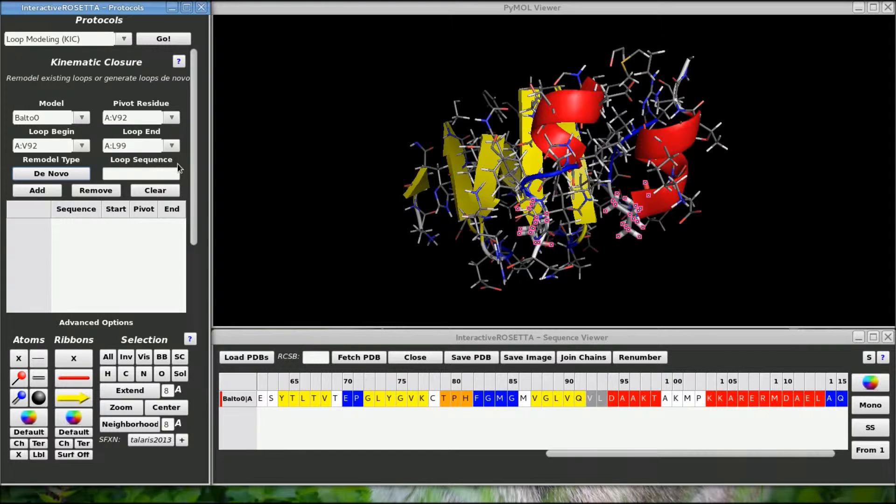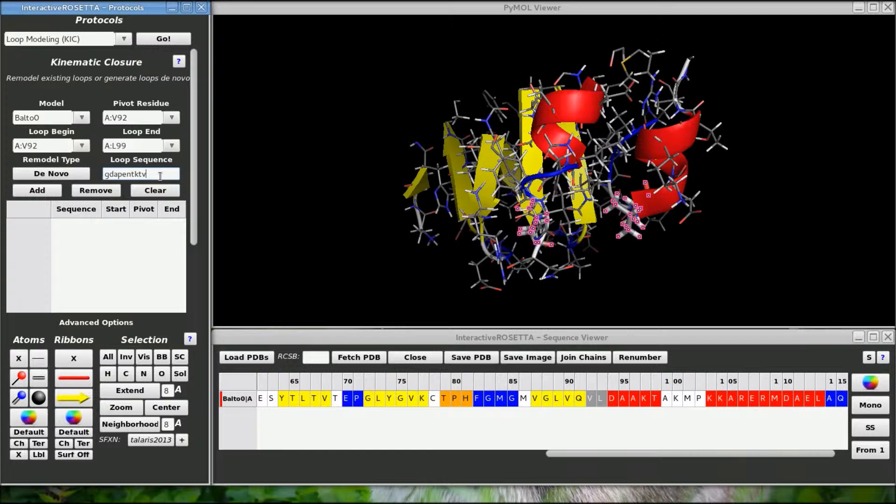Since I am designing a new loop, I need to give it a sequence. This was the original sequence. But I am going to add a couple of extra residues at the end to prove that you can add loops of any size.